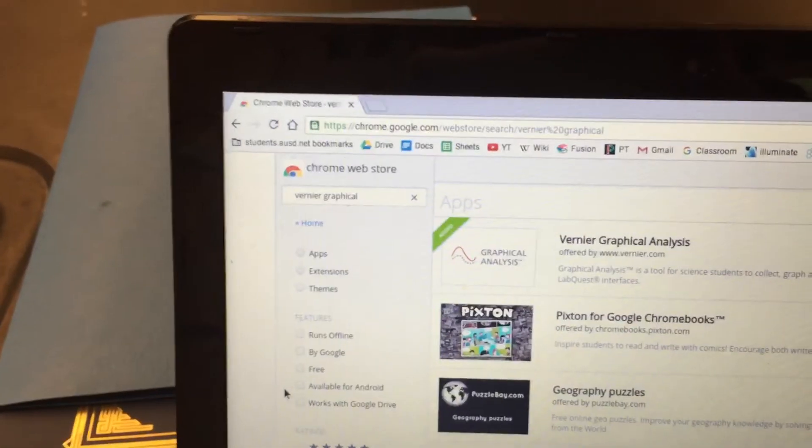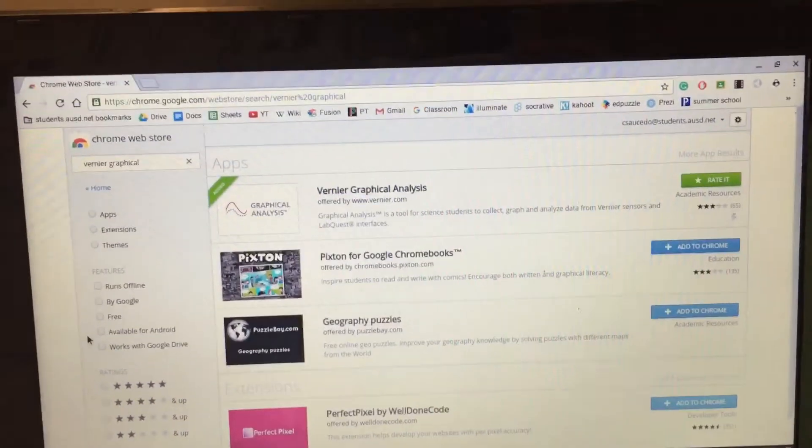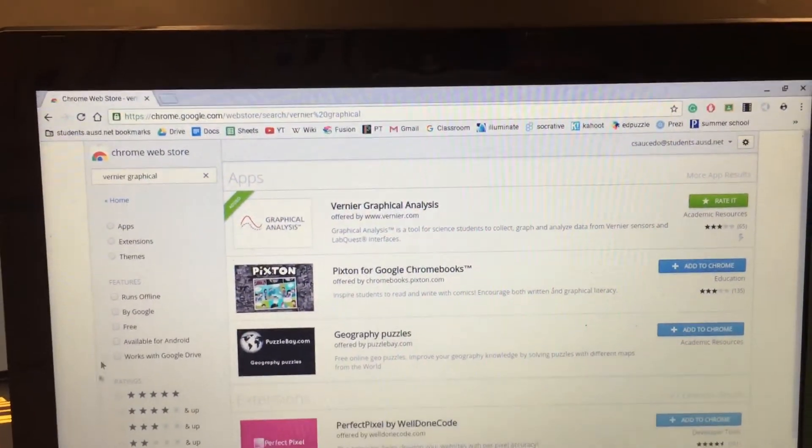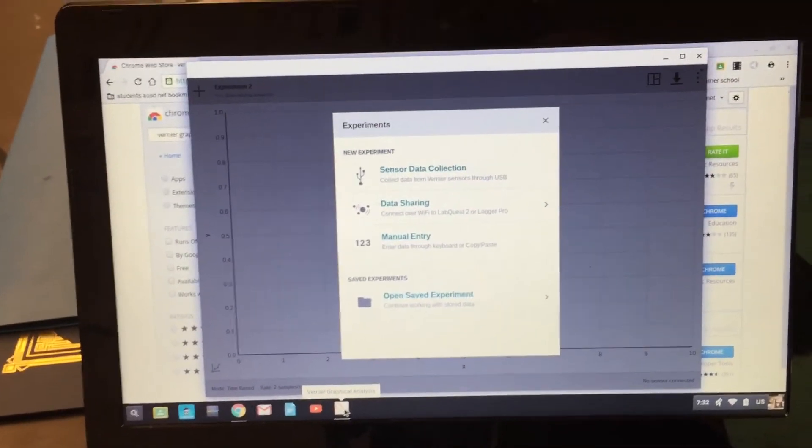So in case you haven't done it already, you need to download Vernier Graphical Analysis, which is an app or an extension for Chrome. When you open it up it looks something like this.